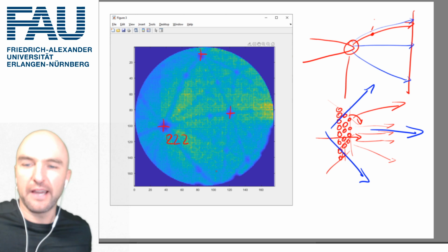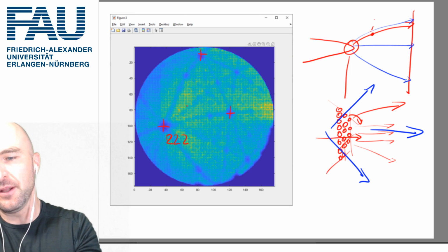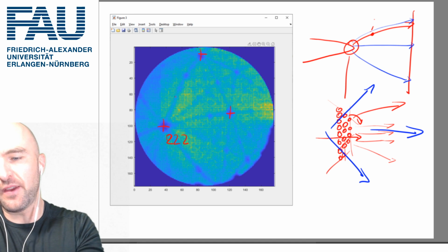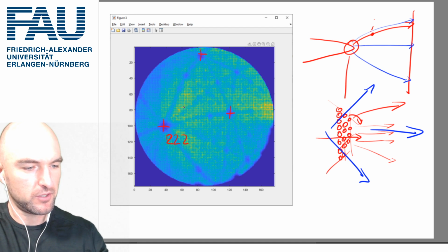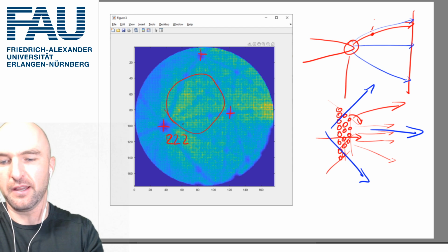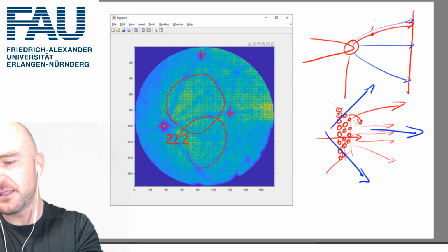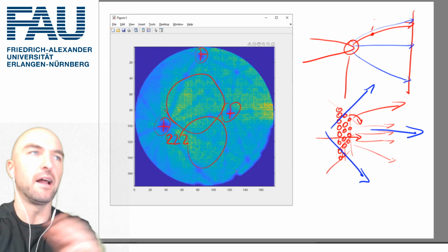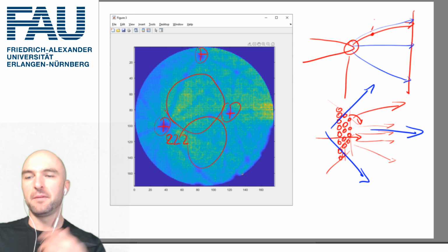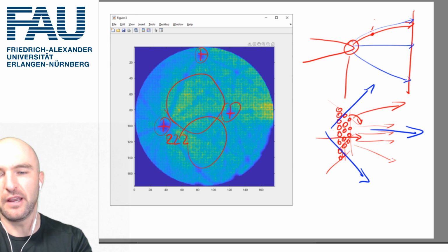And so for us in atom probe, it's very often very important which crystallographic direction we look at. For example, I expect to have very good data in this area here, or this area here. And we will mostly see crystallographic planes around these areas. In aluminium, we will see a lot more crystallographic planes, but this is what a field desorption map is. This is why we very often want to produce those, in order to be able to say something about our sample.